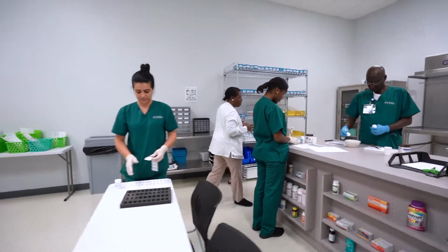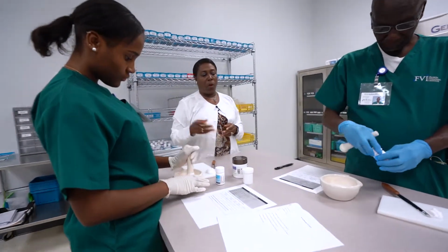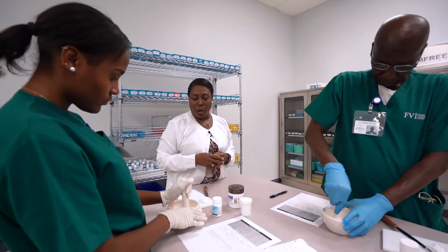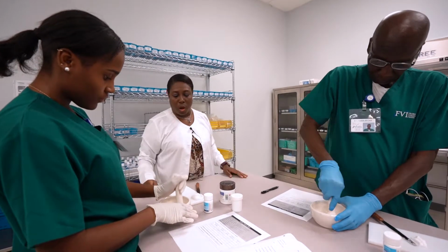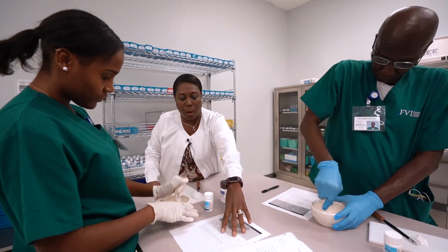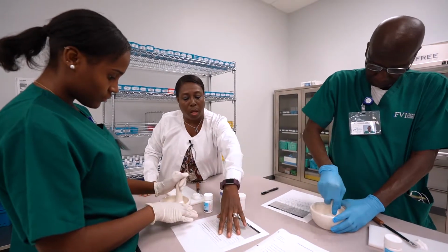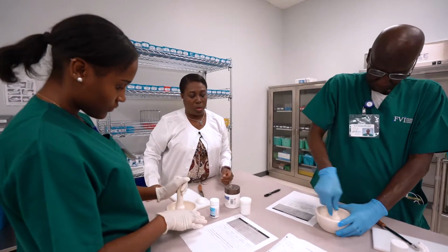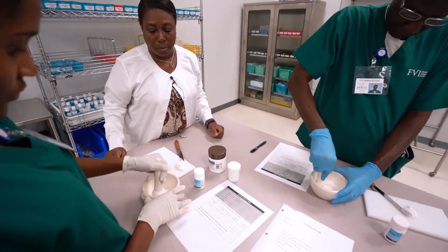Our next area we have is compounding. So we have Ms. Winsaka and Mr. Jean here. They're crushing the tablets. They're using what we call the mortar and pestle. They've already written up their information. First of all, you get your recipe, you write, you document, and then now you are able to make your product. So they're crushing the tablets for this particular product.